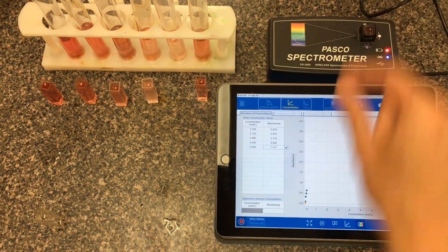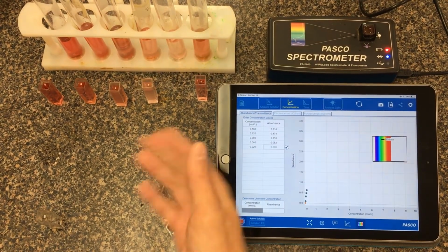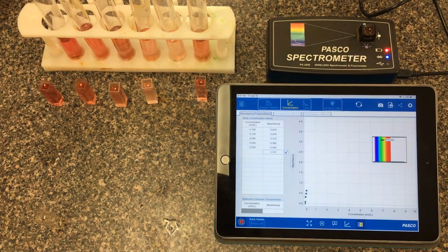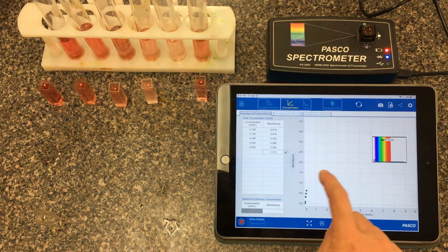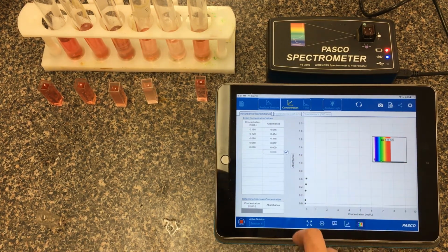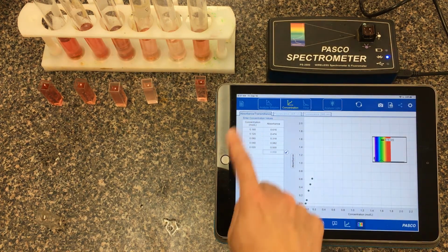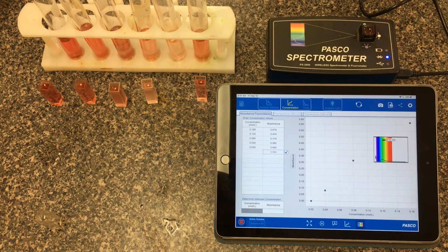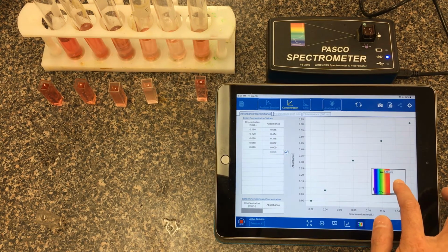So that's solution D. There's our absorbance reading, and then solution E. Okay. That one there was fairly faint, so probably it's not even getting a signal, so let's just keep it at absorbance of 0, fine. Okay. Now that's not looking like too much because our scale here is very off. Again, you can change the scale by toggling these side to side, because we're talking concentrations like 0.16 or so as a max. You can scroll it in here. What's nice here is you can actually just press this and it'll just maximize the sample window for us. Should we just pull this away here?